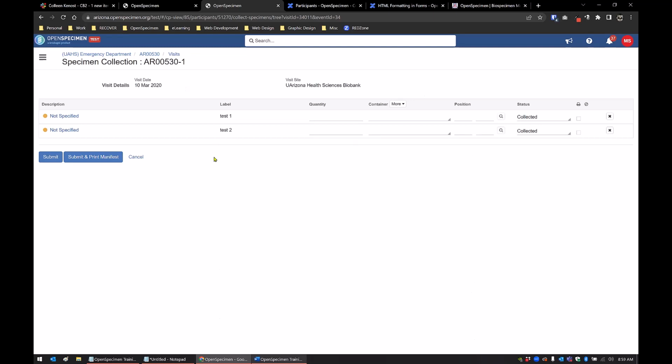So I thought I'd ask. Oh, okay. Yeah, now you just have to make sure you add the label, what you want each sample to be called, and you separate it by a comma. Correct. And more importantly, it won't allow you to store the label unless it matches the format.